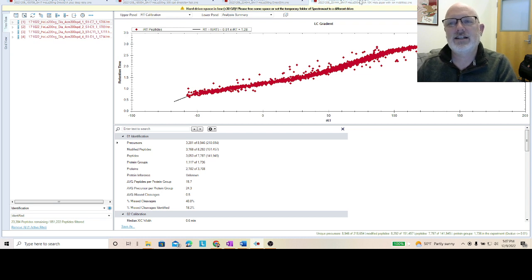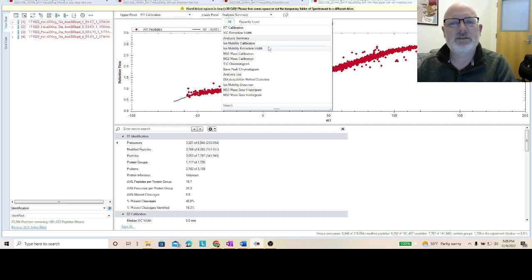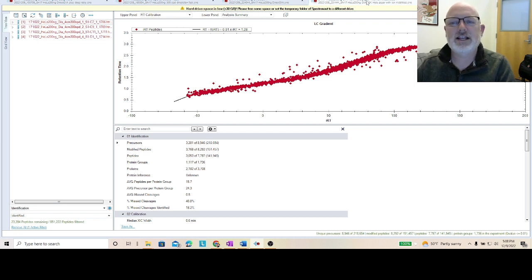So I downloaded the data, made the library, and then I exported it and re-imported it into 16, which is a trick to make ion mobility values from Thermo data. So you can actually import Thermo data in Spectronaut, and then if you export it and re-import it, or just import it in 16 or 17, it will make the ion mobility values for you. So that's useful for mass spectrometers with ion mobility, like the timsTOF or Waters, I think. Maybe Agilent has it too, I don't know.